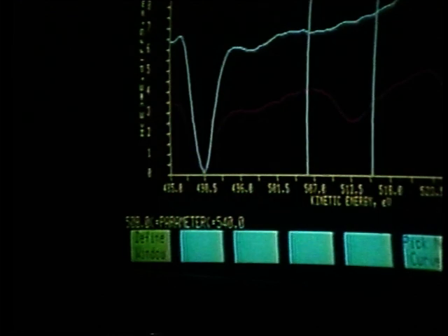So right now we are performing the operation of redefine, where once again it is looking at every window that we have stored every cycle, and it is changing the analysis window from 495 up to 520. We have redefined that to a window of lower limit 506, upper limit 515.5.